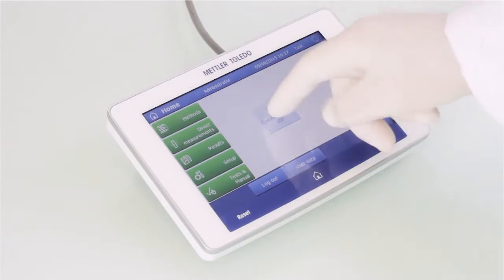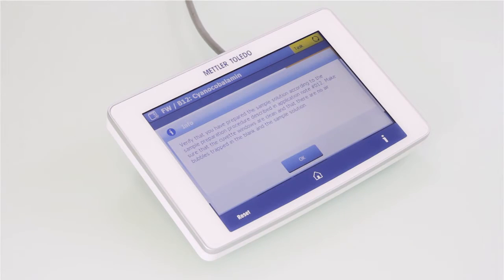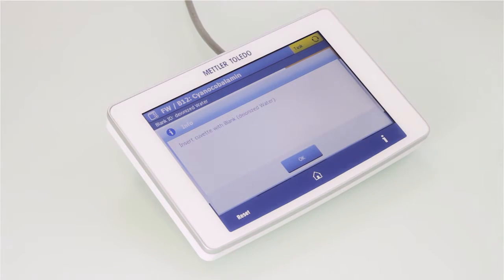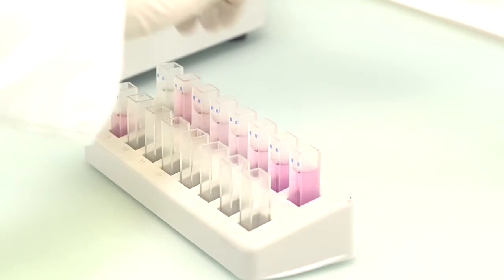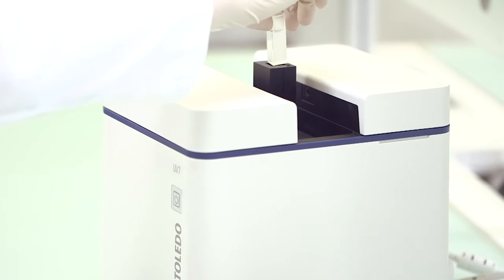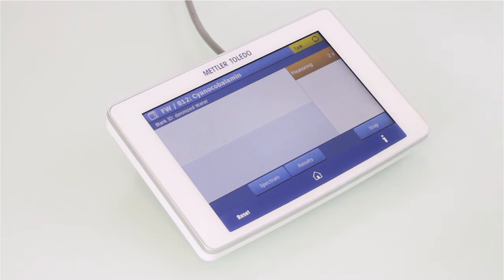For convenience, all routine methods can be started by a shortcut from the home screen. At method start, the user is informed about the sample preparation procedure.